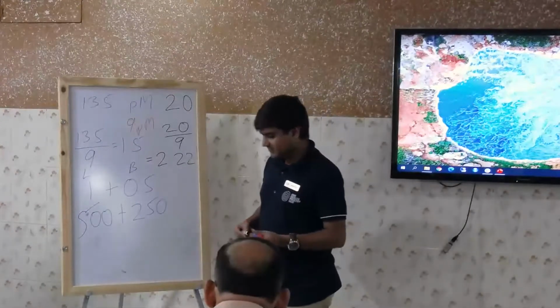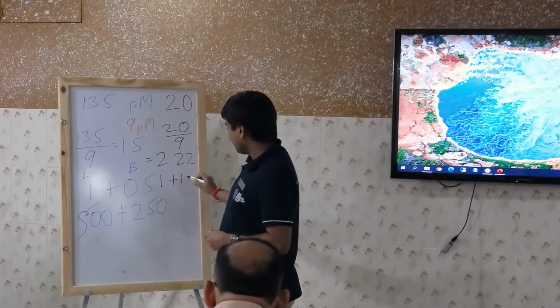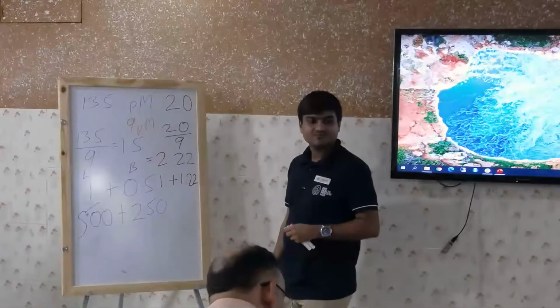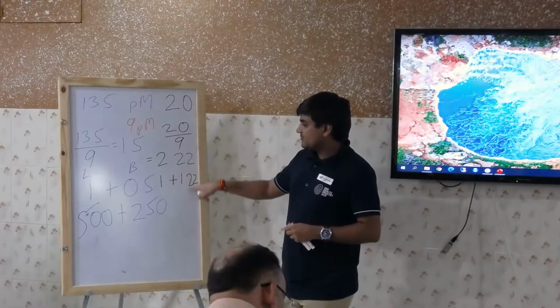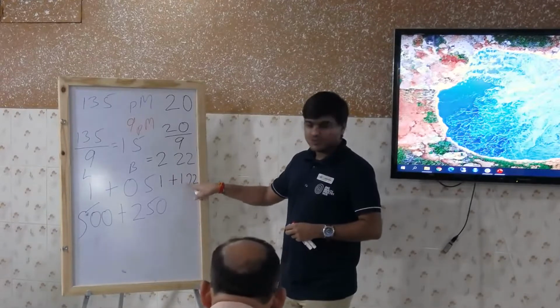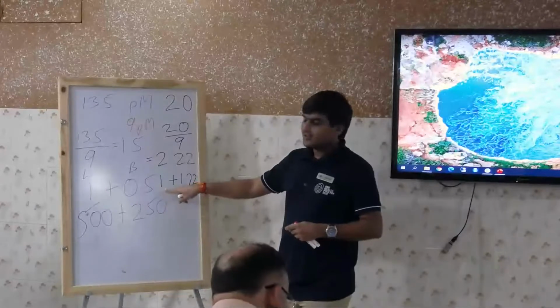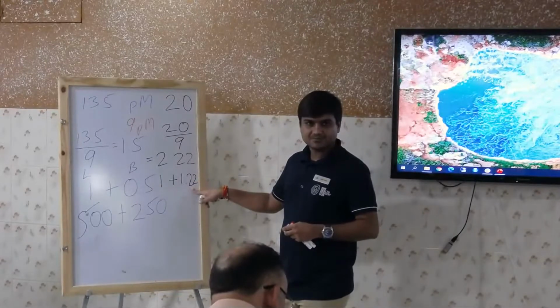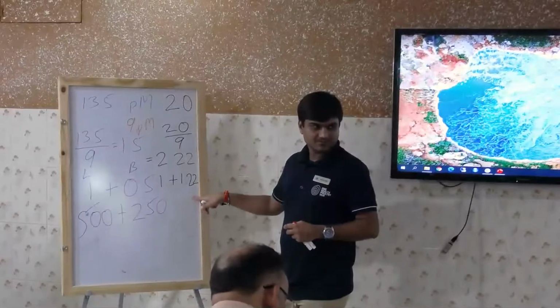That means that one part will be library and 1.22 will be my buffer. This is because one part you have taken already of your stock library. So 1 microliter plus 1.22 microliter, scale it up, 100 microliter library plus 122 microliter of buffer.